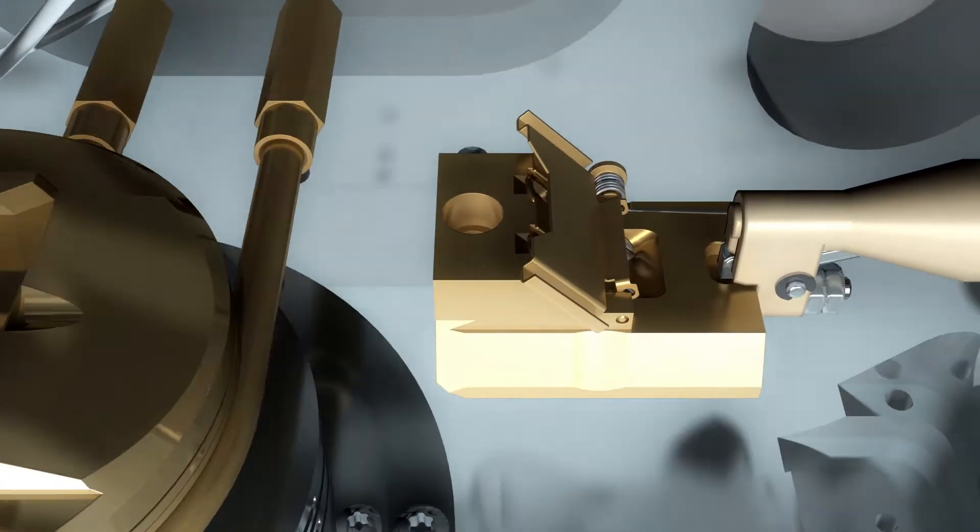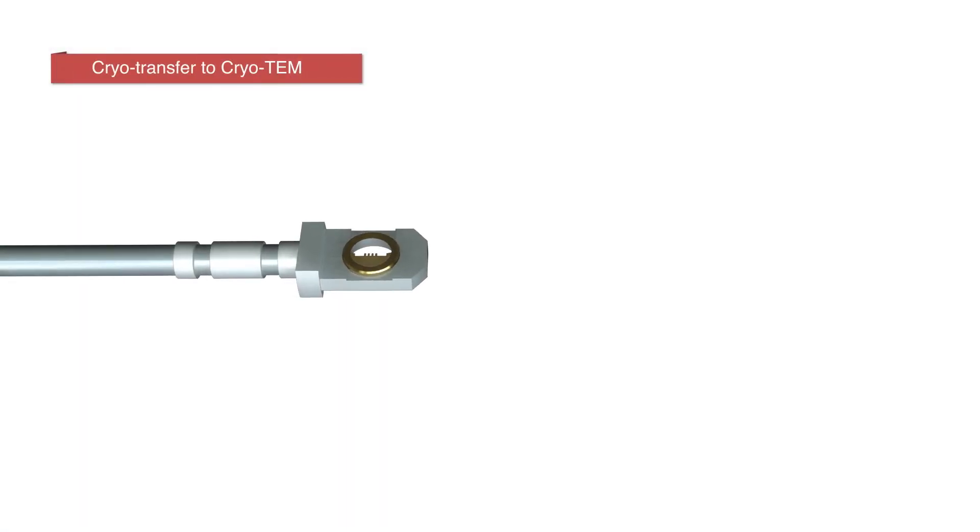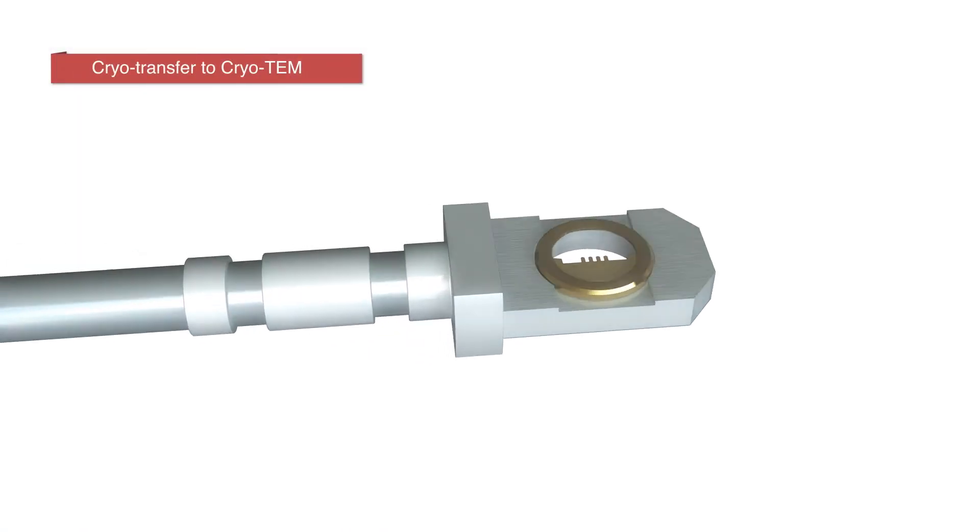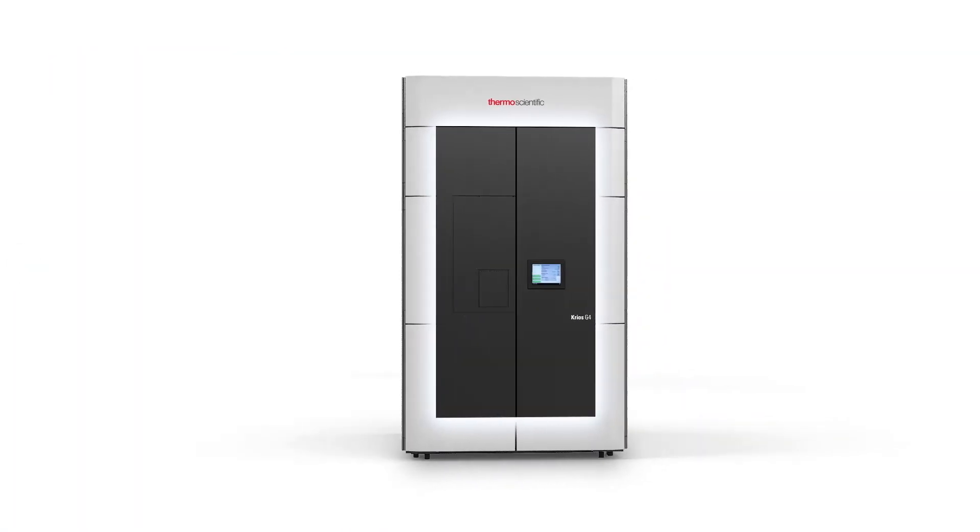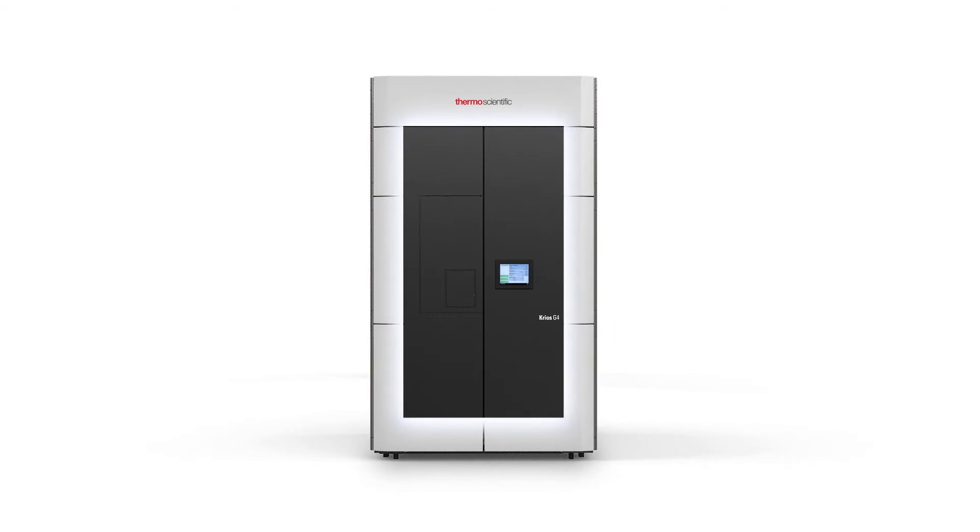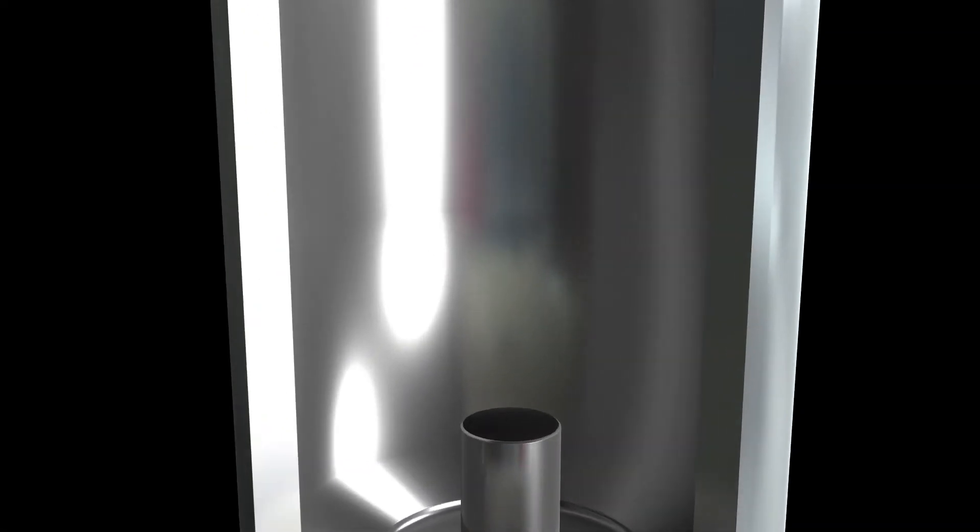The sample is now transferred to the Krios TEM system. The Krios is the leading Cryo-EM platform and a 300 kilovolt transmission electron microscope. It allows loading of multiple grids using an automated sample loading system.